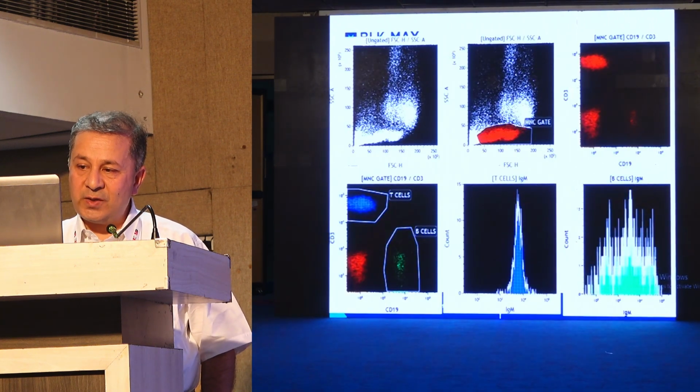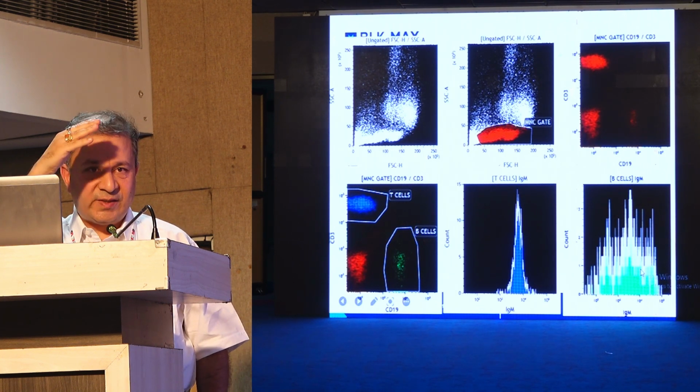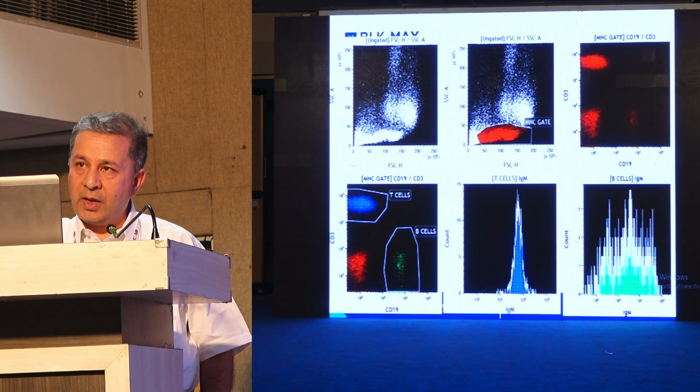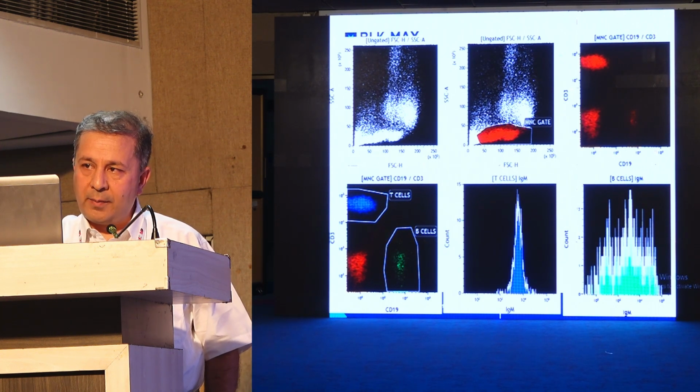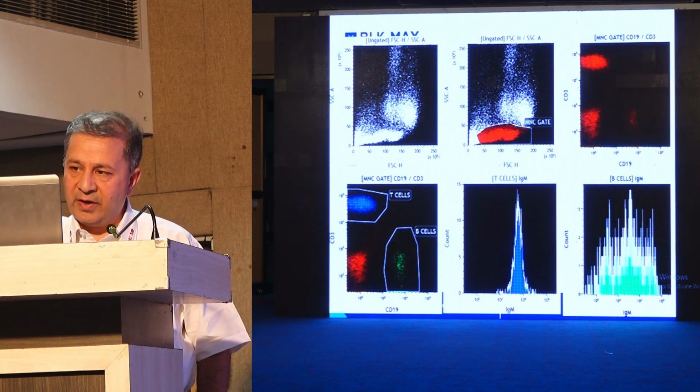And here, this is a positive case. Just see this T cell, it's moved rightwards, but in B cell, from what you had seen in the previous slide, it will be difficult to differentiate how much of a positivity you got on the graphic pattern. But when you look at the numbers, you're able to actually decipher it very clearly.